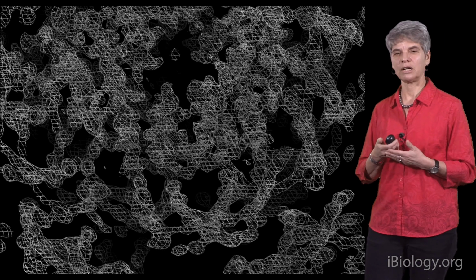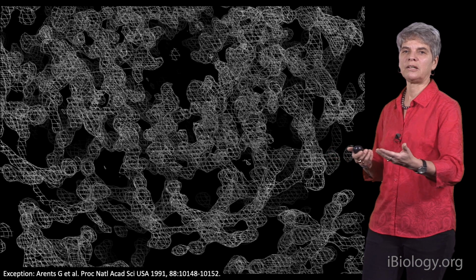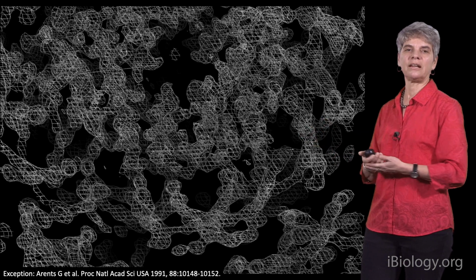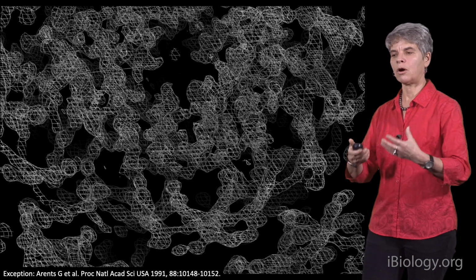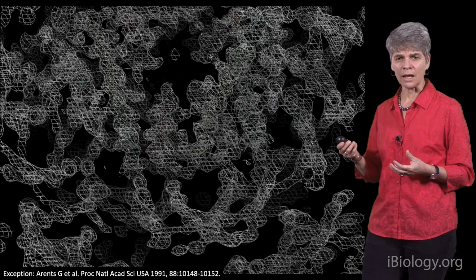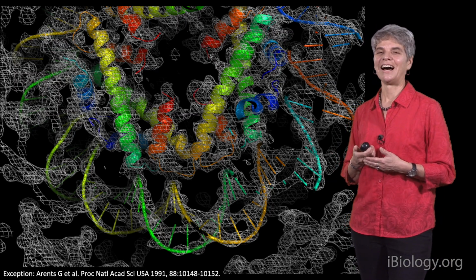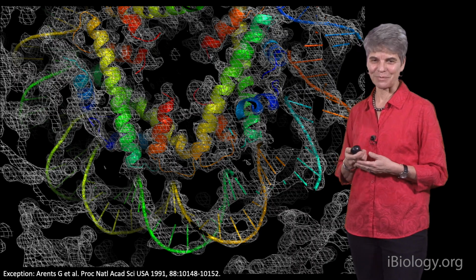Now this was really, really difficult because we had no idea where to start. We had no idea what the secondary structure of these proteins was. We had no idea where the DNA was. This is the raw data that we had. And so this is like a big three-dimensional puzzle. And only when all the parts are fit in correctly can you account for all the electron density. And so this is what the final product would look like. And this required, as I said, about 1 year of work in a dark room in front of a computer monitor. Not a very social experience.